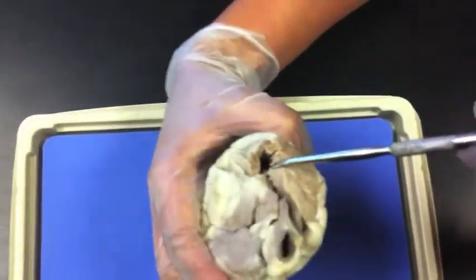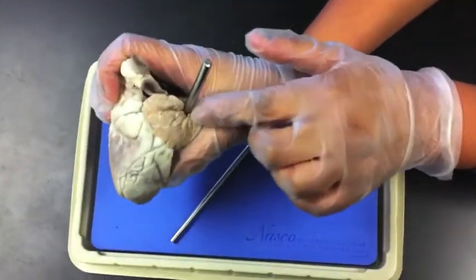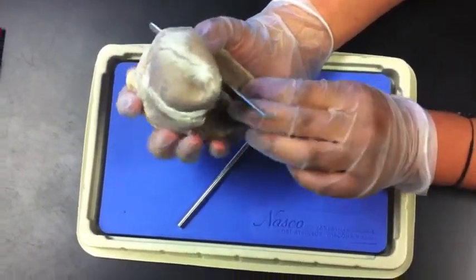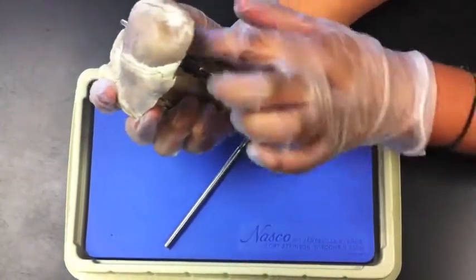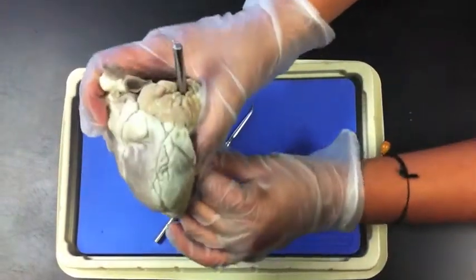And then this hole right here, which is located right behind this auricle, if I put my probe through this, we can see that the pulmonary vein would carry blood back into the heart. And it would go through the left atria into the left ventricles. So that would be your pulmonary vein.